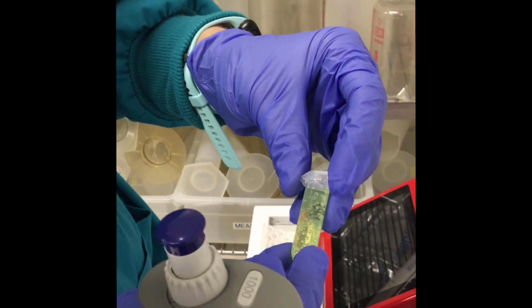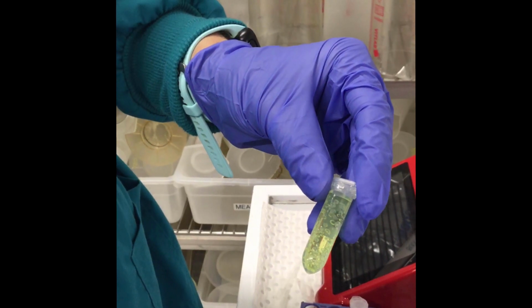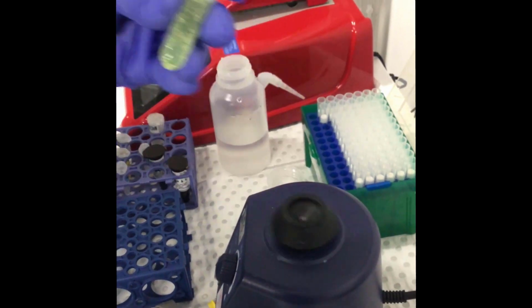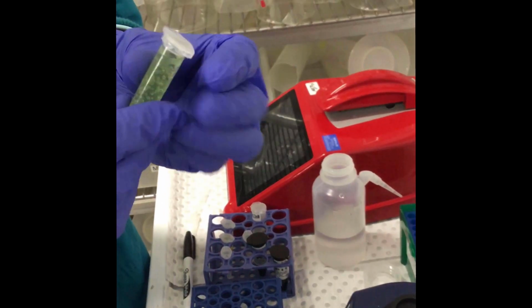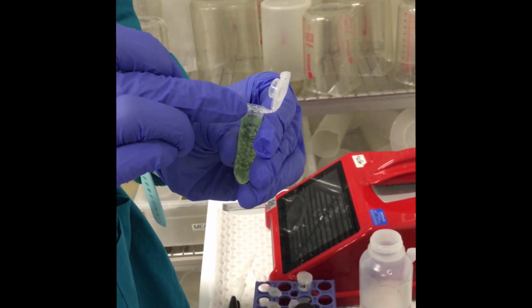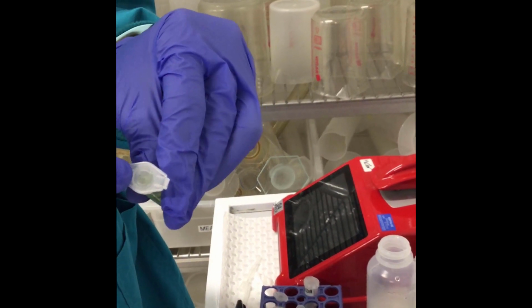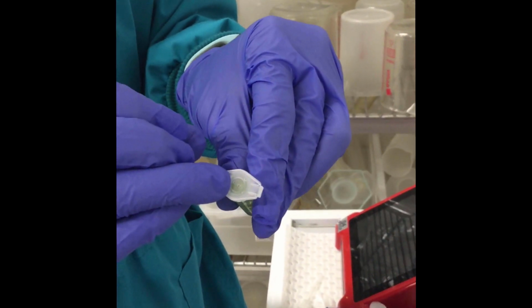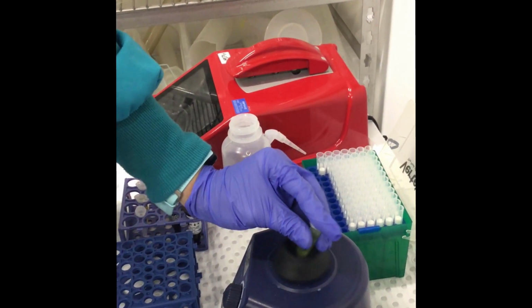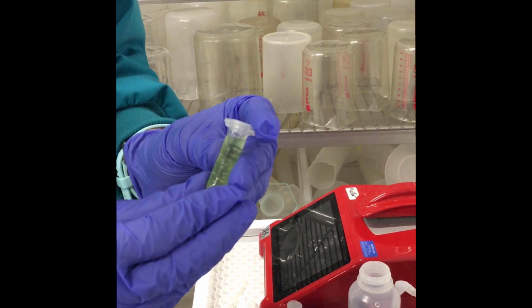Absolutely. You can see that there are some gas bubbles built up in there already. For the next 10 minutes, you will vortex the tubes every 60 seconds or so. This just assists in the reaction and allows the gas bubbles to move up to the top. Now you need to make sure that you're not inverting your tubes, because remember, we've pierced our tubes with a lancet already. So just a very gentle vortex, and then allowing that air to be released.